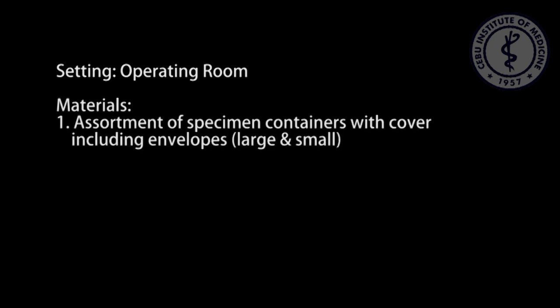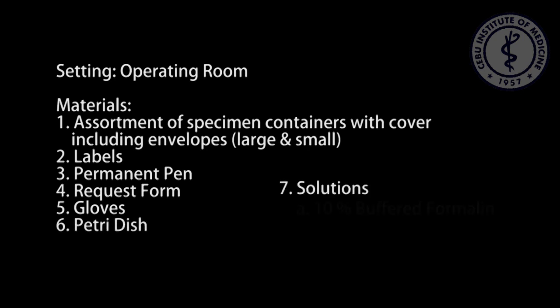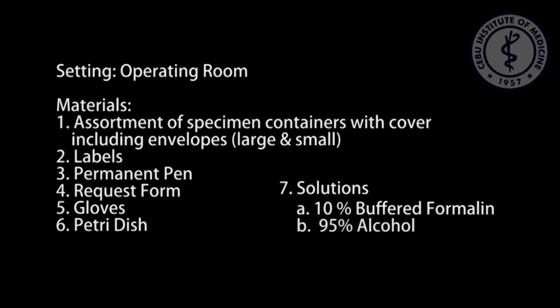Specimen Preparation. Setting: operating room. Materials: assortment of specimen containers with cover, including envelopes large and small, labels, permanent pen, request form, gloves, Petri dish, solutions, 10% buffered formalin, 95% alcohol, plain NSS.